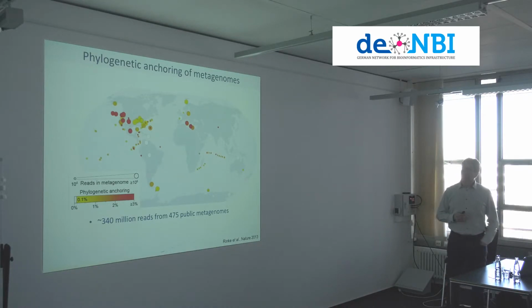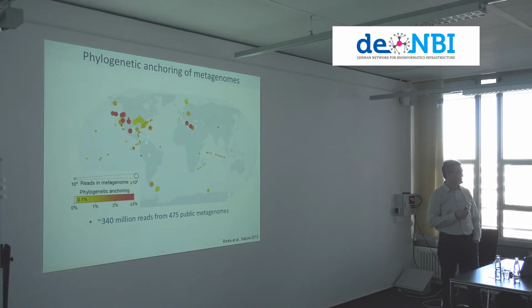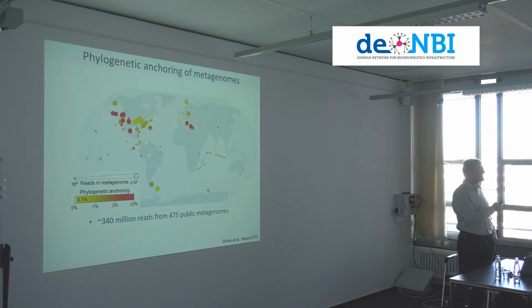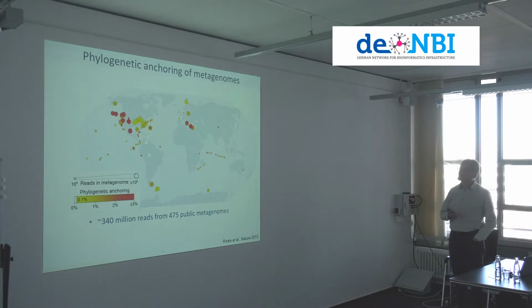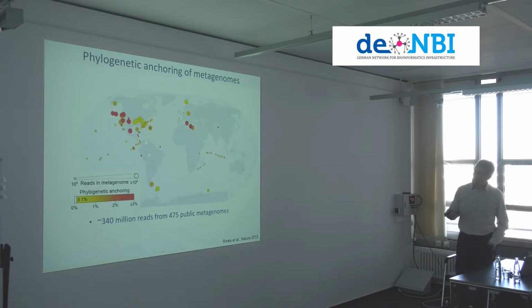You can take a number of reference genomes and map the reads back to the reference genomes. Right? And as I said, there was a huge bias in the database, and if genomes are missing, reads might be classified to the wrong organism, right? Because the best match, you always take the best match, right?